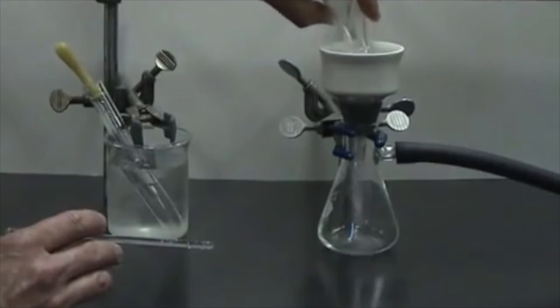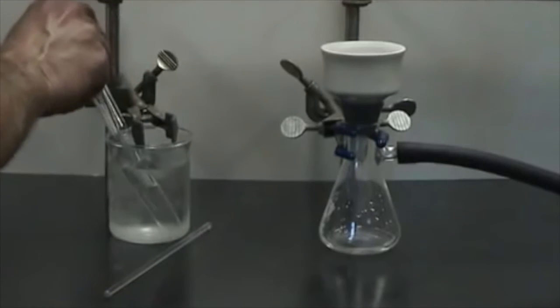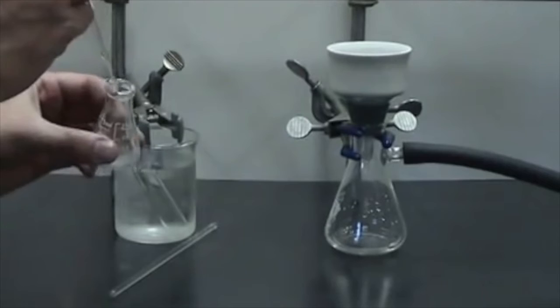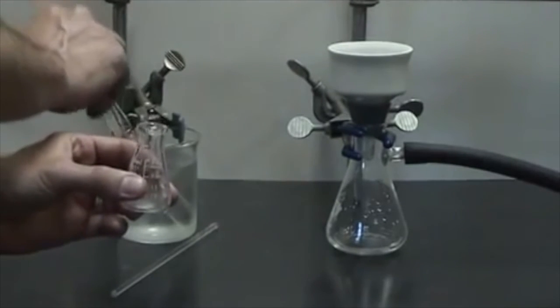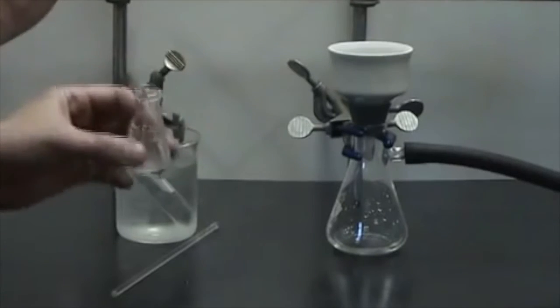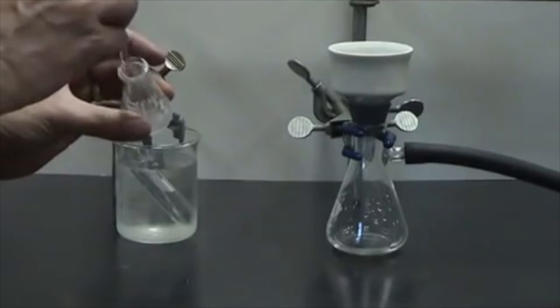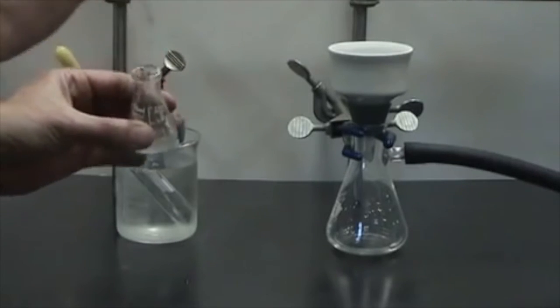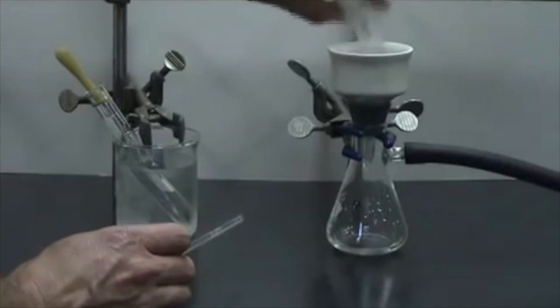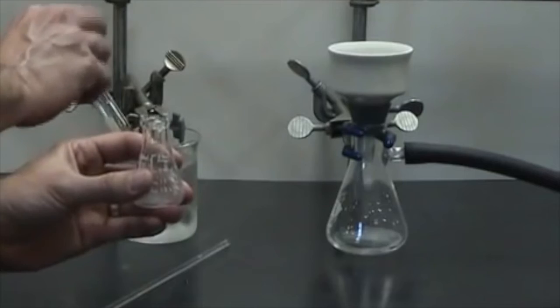Then, wash the crystals in the Buchner funnel with a small amount of cold recrystallizing solvent to remove any supernatant liquid adhering to them. Keep doing this to get as many crystals as possible.